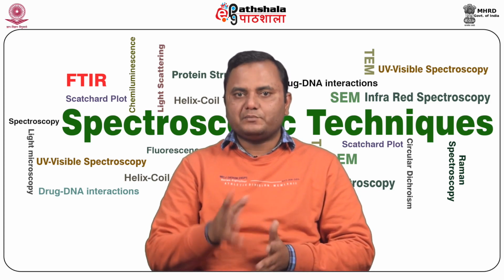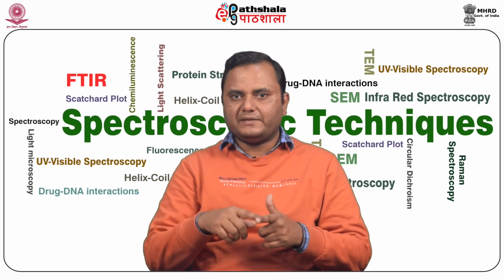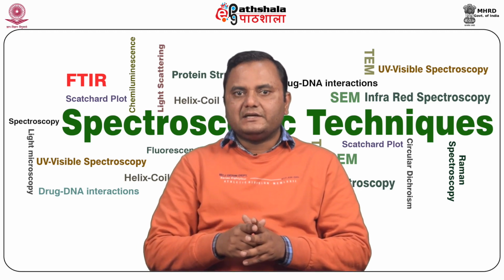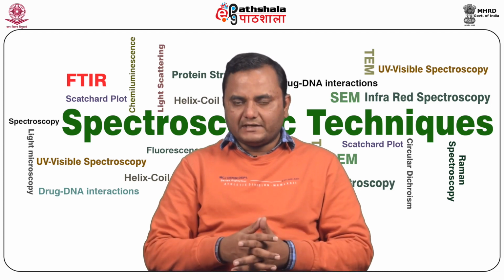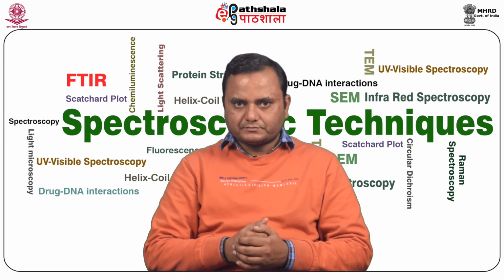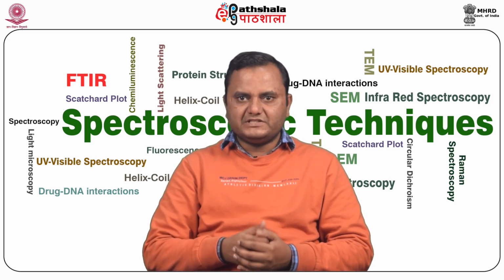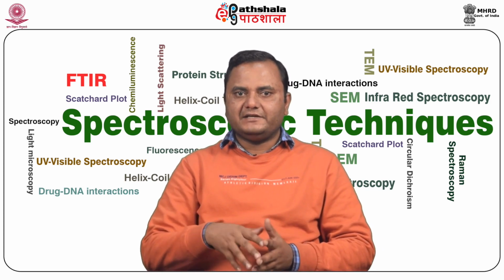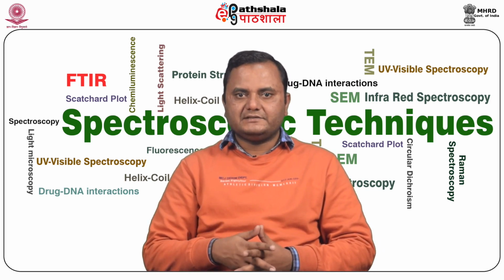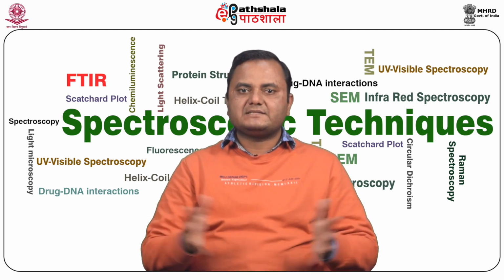However, a circularly polarized light beam results from the sum of two perpendicular plane polarized light beams dephased by 1/4 wavelength, or pi by 2. If one of the circular components, left or right, of a plane polarized light beam is differentially absorbed by a dichroic sample, it results in an elliptically polarized light beam.